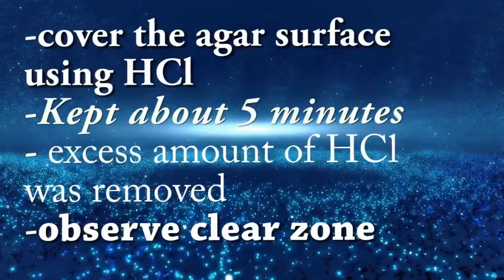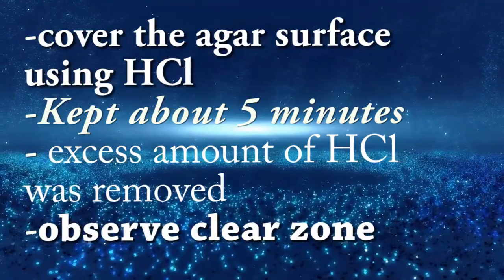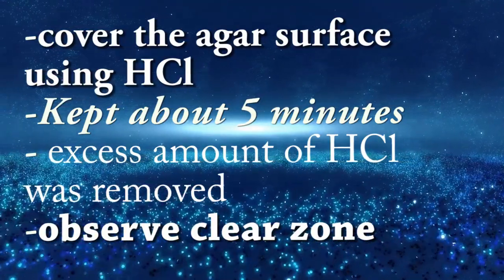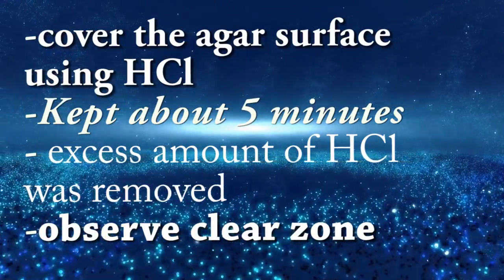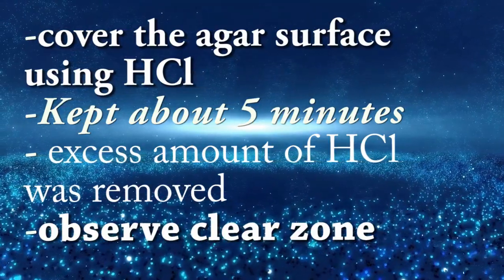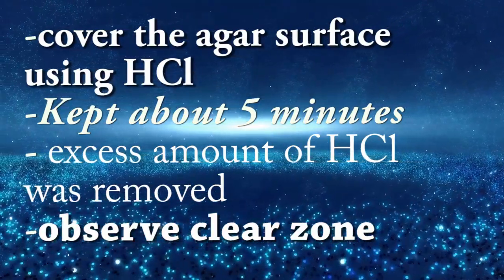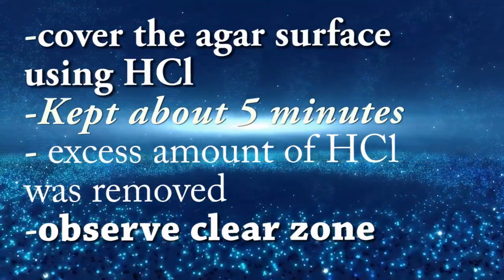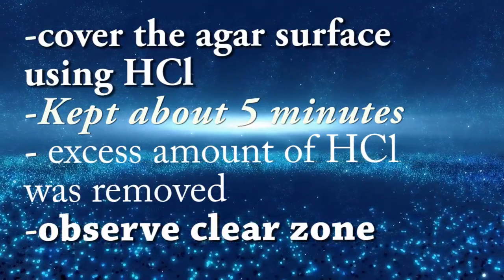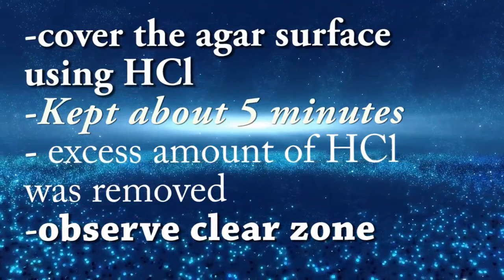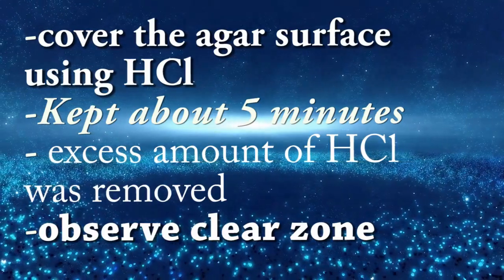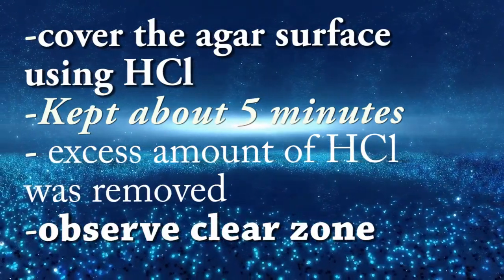After incubation, the surface of the medium was flooded with HCL. The medium was kept for about 5 minutes, then excess HCL was removed and the clear zone was observed.